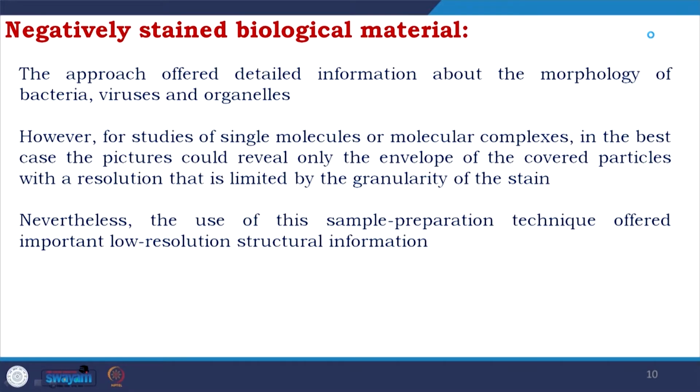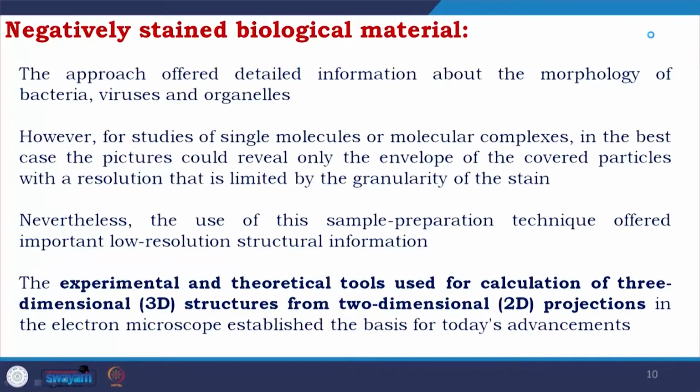Nevertheless, the use of this sample preparation technique offered important low resolution structural information, as I told, for development of a basic 2D model, to check the homogeneity of the solution and all. This is very good. The experimental and theoretical tools used to calculate a 3-dimensional structure from 2-dimensional projection in the electron microscope establish the basis of today's advancement.